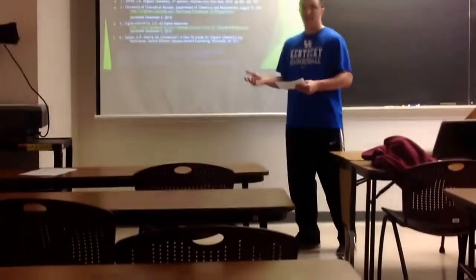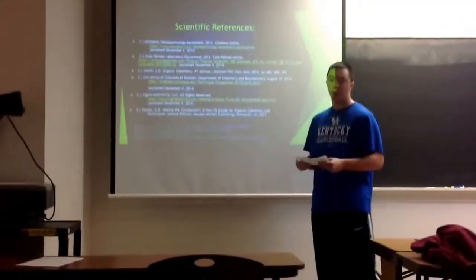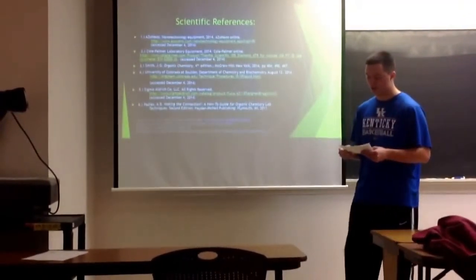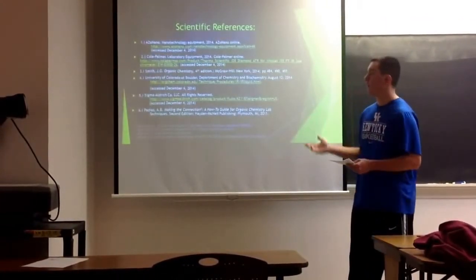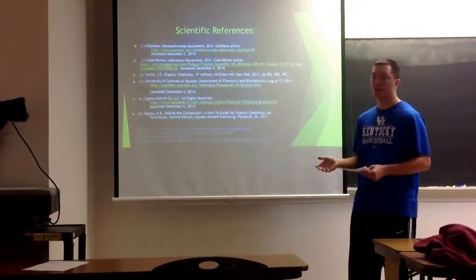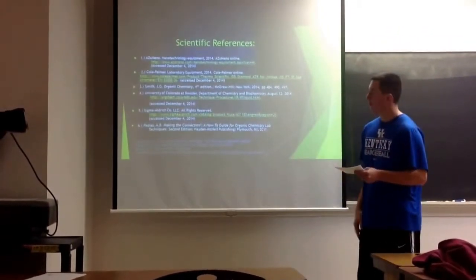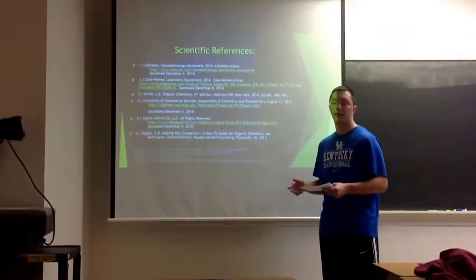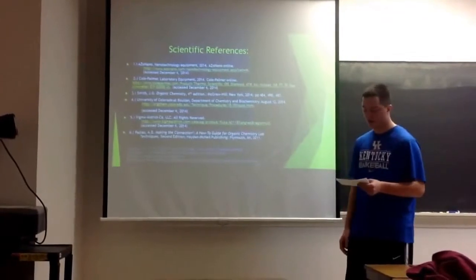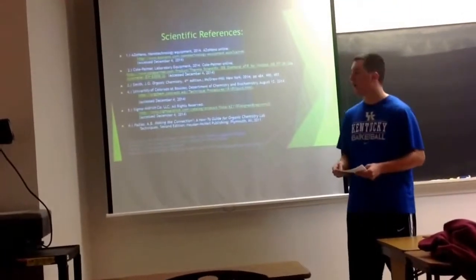And I don't think this actually occurred to us, but you always want to make sure you place your product directly in the middle of the salt plate to ensure the best read from the spectrometer. Of course, like I said, I don't think that happened to us, but that's definitely an error that you want to make sure doesn't occur. Like I said, if this experiment were to be done again, I would definitely use more scans and monitor that ATR attachment on the IR spec for our solids. Small details like that can make a huge difference in your outcome.